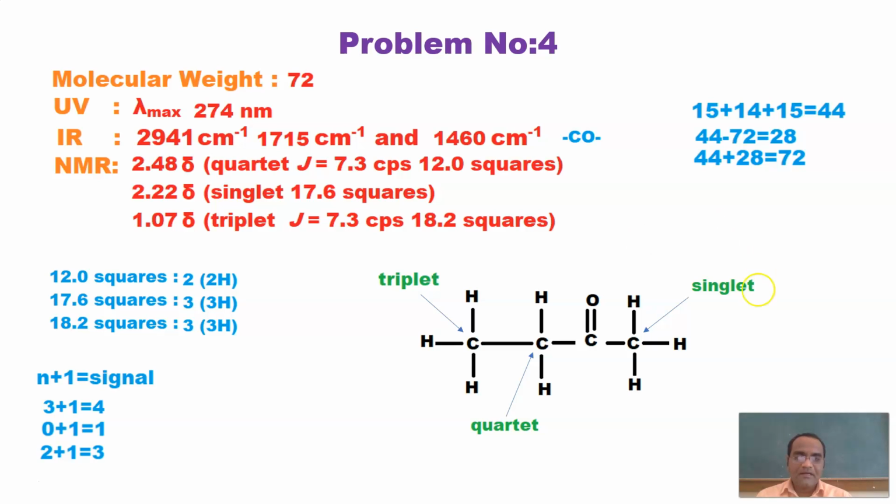That is the first criterion. Secondly, if we look at the NMR values, it is coming in the ketonic region. Whenever the values are almost near 10, it is a carboxylic acid, and almost 9, it is an aldehyde. So that cannot be, and no further addition can be done for an amide or ester because the molecular weight does not fit. It does not match, so we are not adding. This will be the final structure. The molecular weight is now exact, the NMR data values are also exact, and the IR data is also exact.